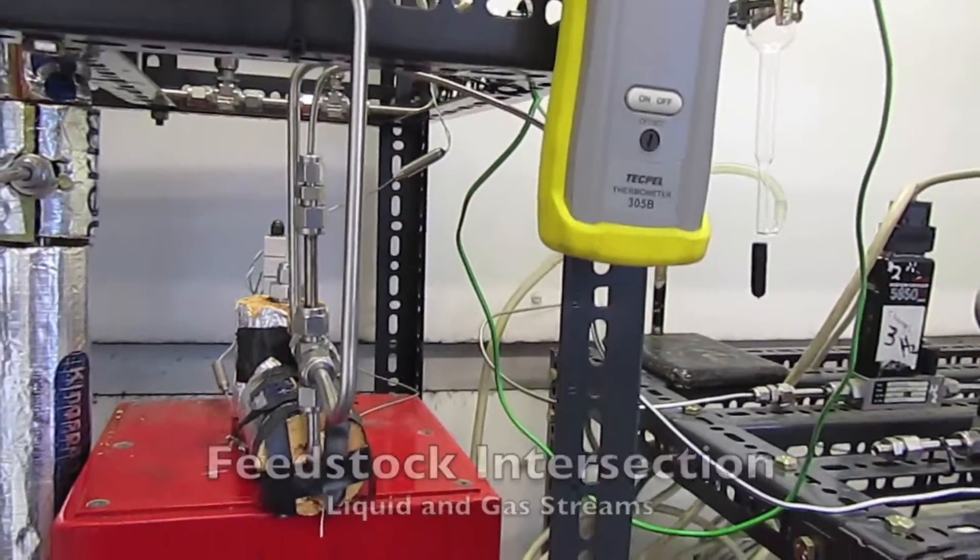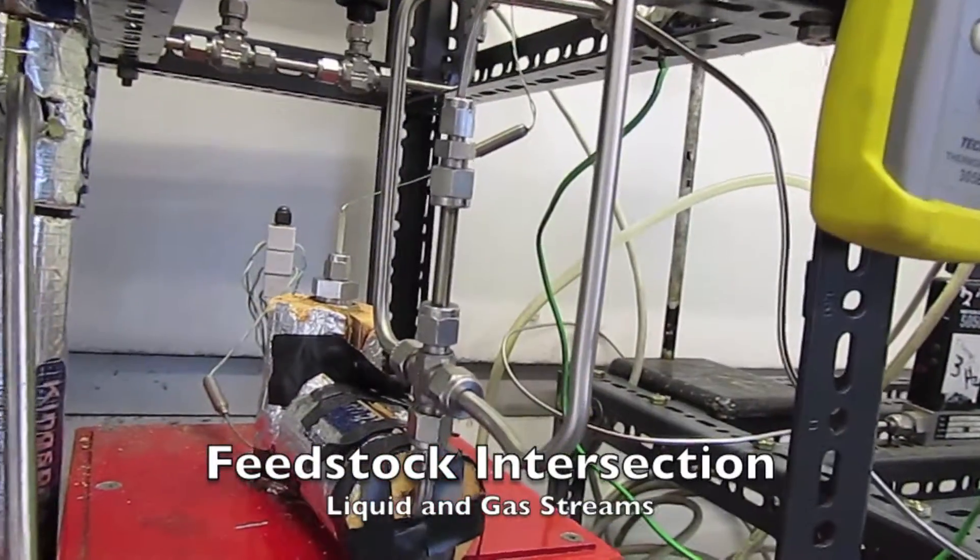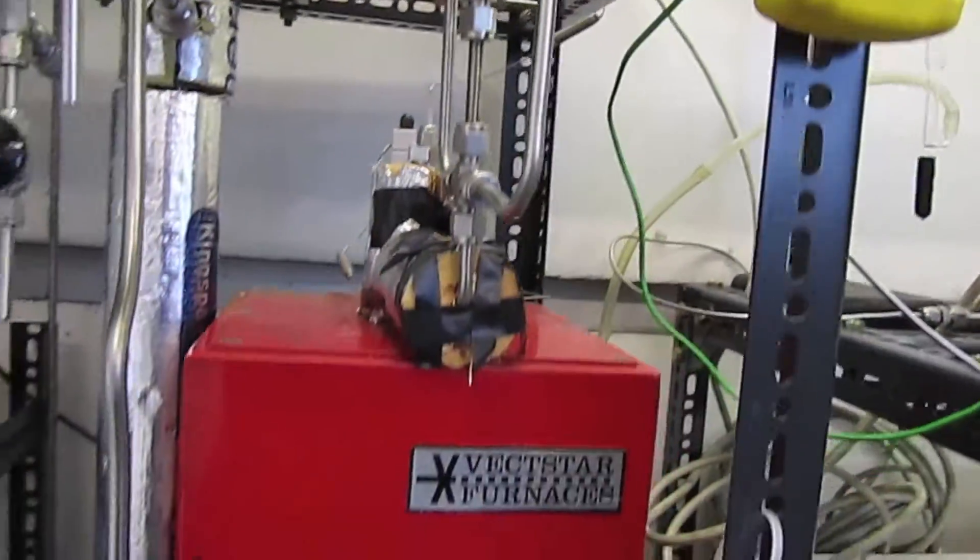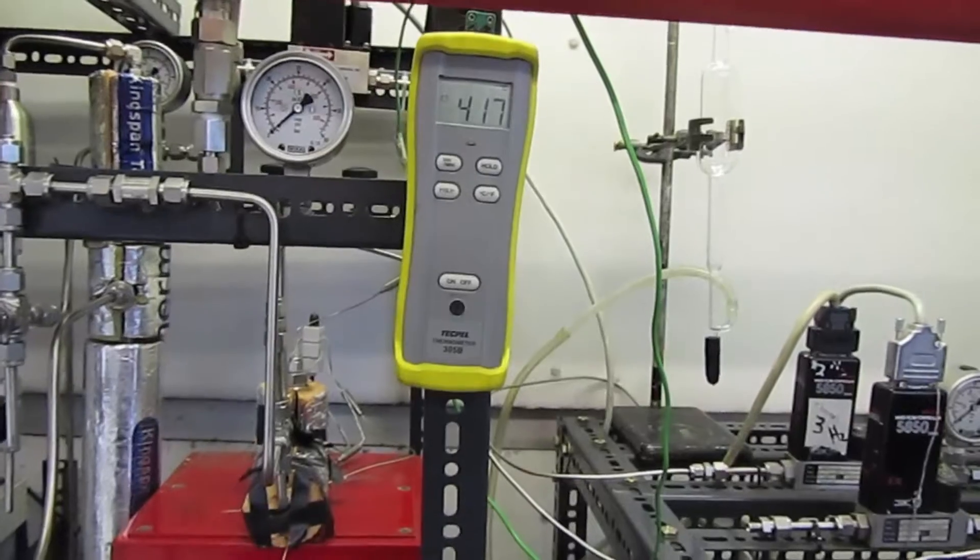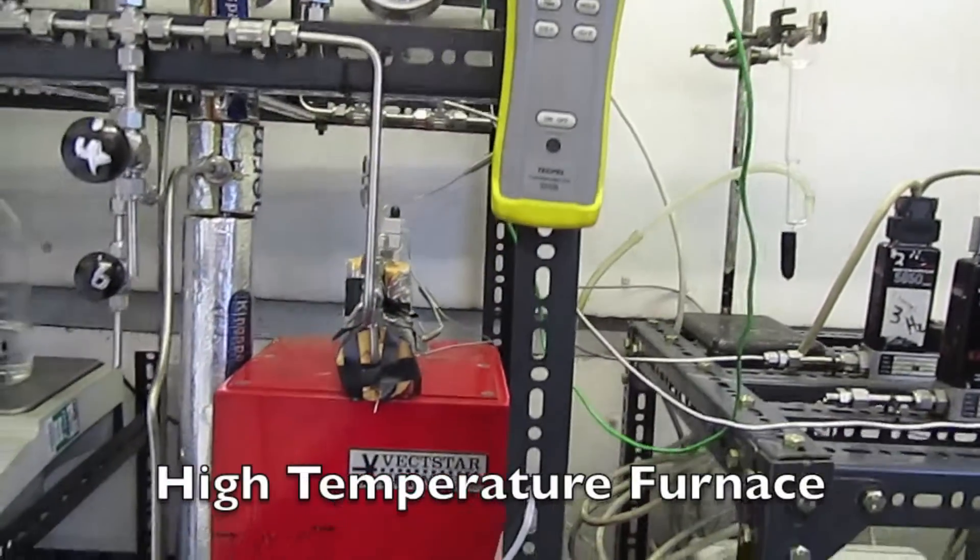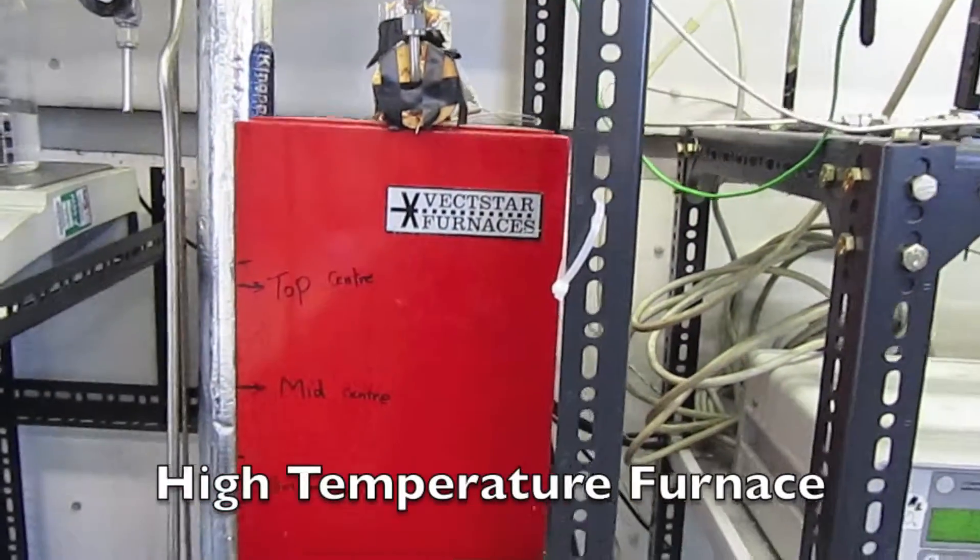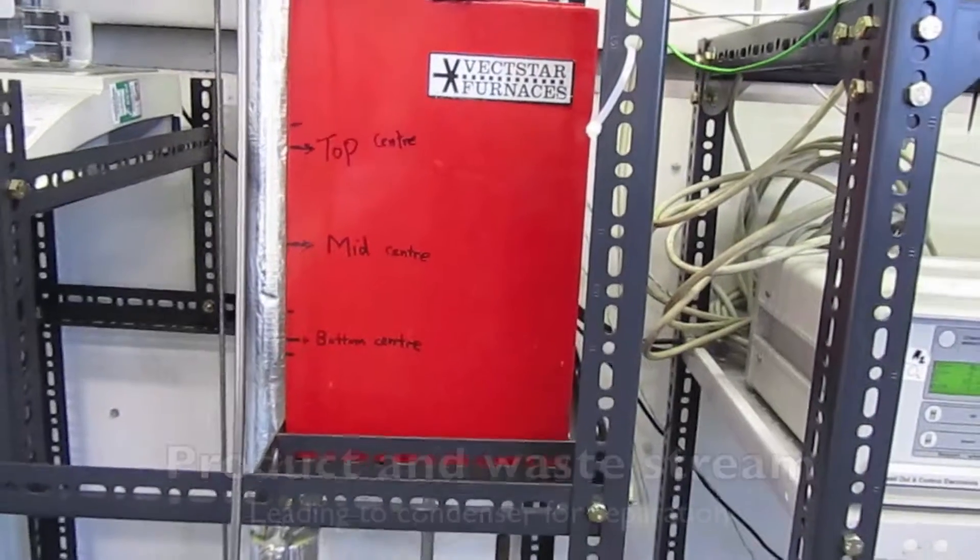Gas and liquid streams are mixed prior to entering the top of the reactor tube at this feedstock intersection, and the furnace is divided into three thermal zones in order to maintain a uniform temperature profile inside the reactor tube. The reactor tube runs down the centre of the furnace.